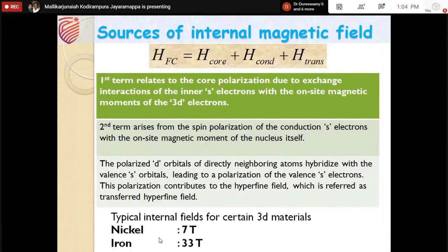What I mean to say is that in a commercial NMR spectrometer, the selection of frequency depends on the strength of the external magnetic field. We can tune or make measurements at whatever frequency we want in a commercial NMR spectrometer or any other conventional NMR spectrometer. But in internal field or zero field NMR, we have to make our electronics suit that particular frequency or particular sample we are planning to study.